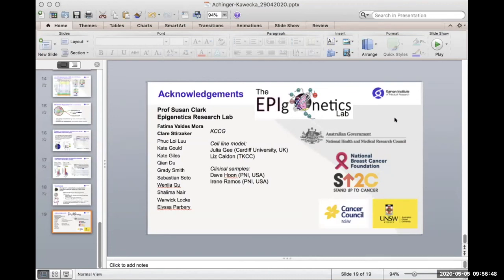Subhashri asks, how do you identify different compartments A and B from the Hi-C data? So I know there's a couple of different methods to identify compartments. For this work, we used Homer, which was the easiest one because it just works on mapped reads files, or BAM files. So these are just PCA kind of analysis, but I know that Juicer as well has now eigenvalue compartment calling. So there's a few different methods. Yes, but in this work, we used a software called Homer.